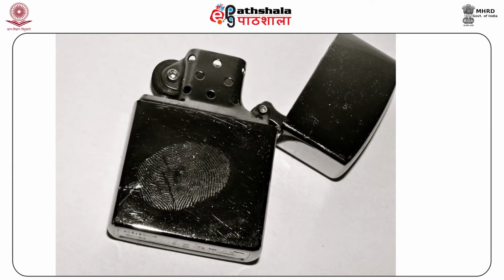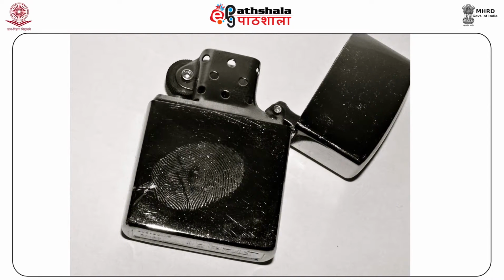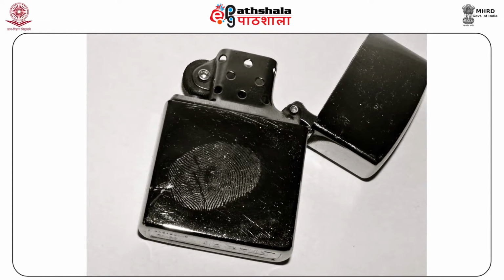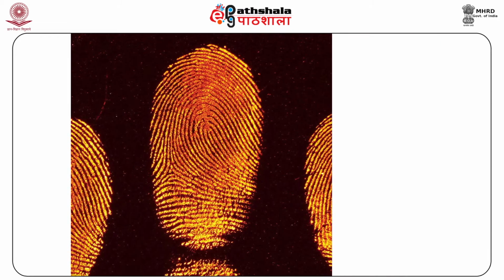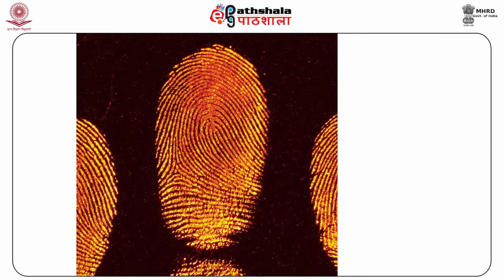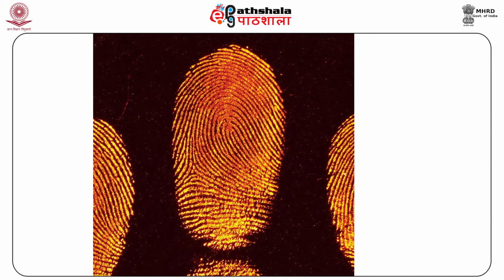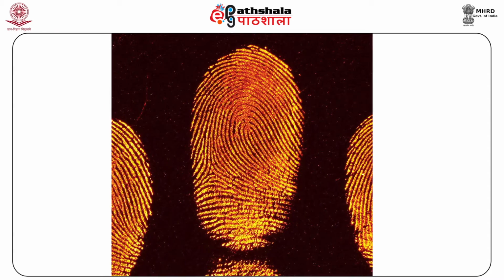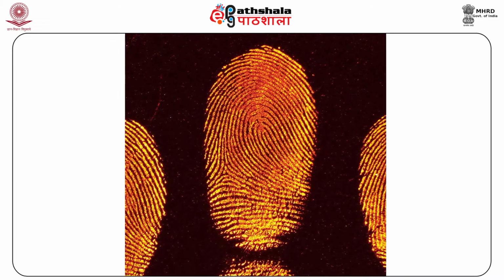Even though cyanoacrylate fuming is a convenient and reliable method for detecting fingerprints, the developed imprints are white in color and therefore lack contrast. The contrast may be enhanced by post-treating the cyanoacrylate developed fingerprints with a solution of luminescent dye. Such stains fluoresce upon exposure to laser light, revealing sharp fingerprints.